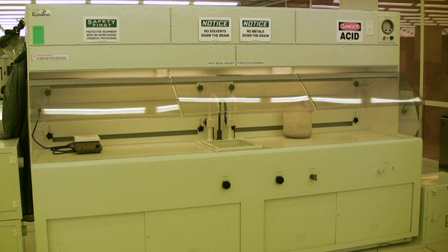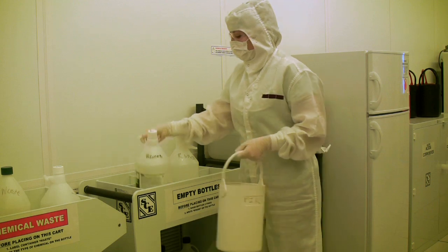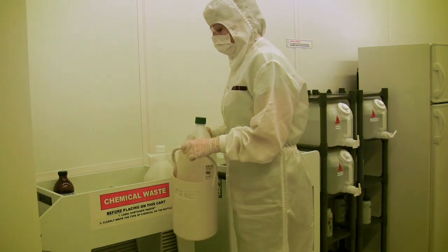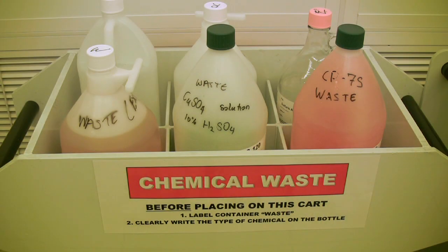Solvents not only react violently with acids and bases, but they can also cause the drain seals on the sinks to deteriorate and can ultimately lead to drain failure, which would be very dangerous. Any chemical waste with metals in it is also not to be poured down the sink. You must dispose of this waste in a rinsed bottle retrieved from the rinse bottle cart in the cleanroom supply storage area — make sure the bottle is chemically compatible. Write what type of waste it is on the bottle and place it on the chemical waste cart, which can be found next to the rinse bottle cart. Bottled chemical waste will be disposed of by environmental health and safety.